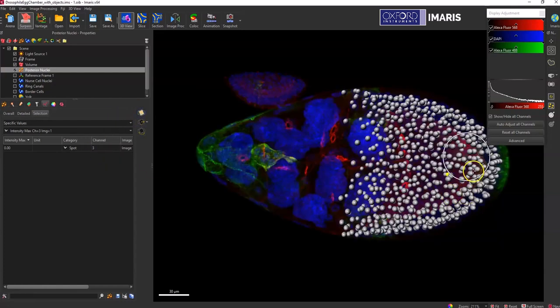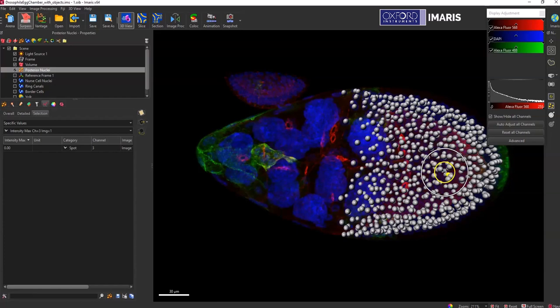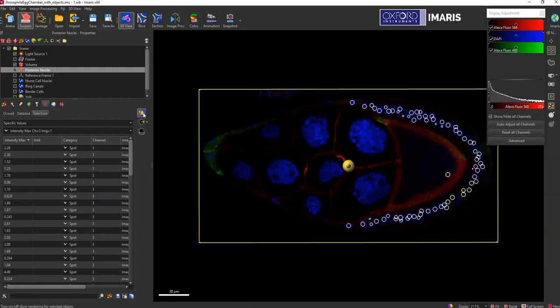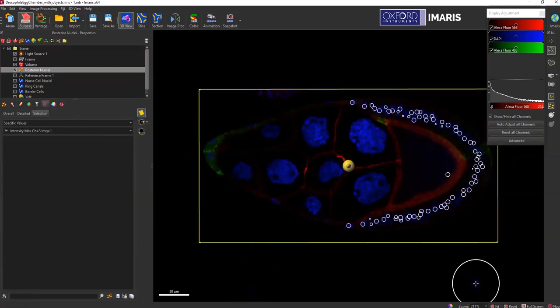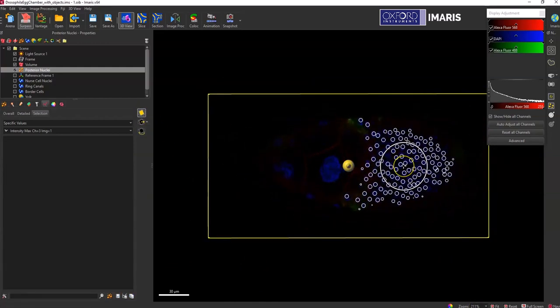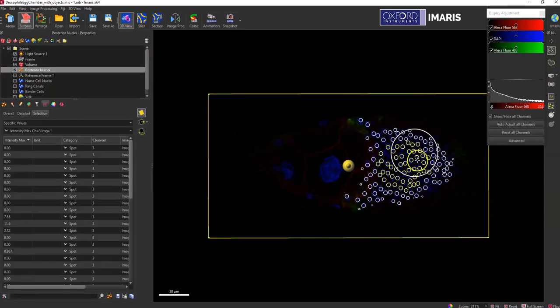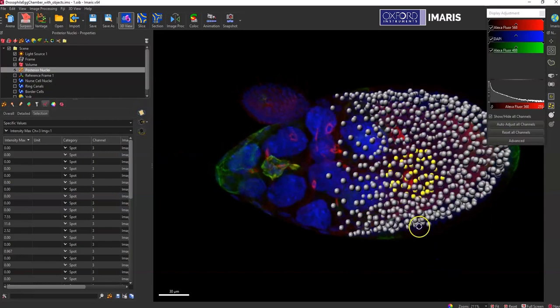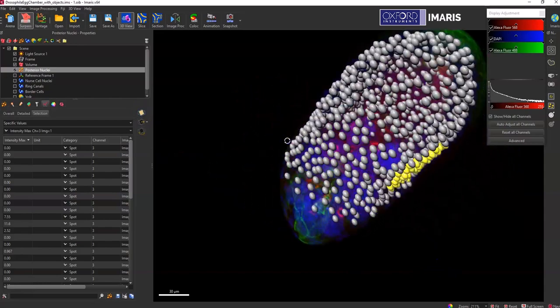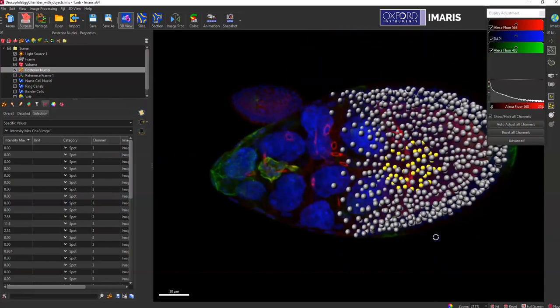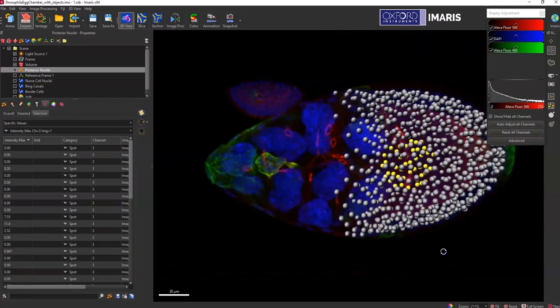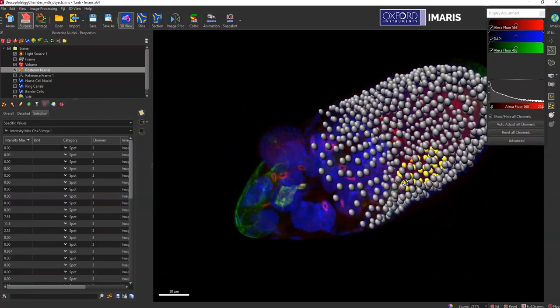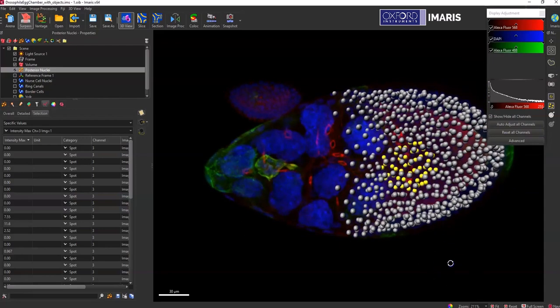But if I switch back to volume rendering, you can see there were a whole bunch more objects that would have been selected if I was in volume rendering. But because I was just in that slice rendering mode, I can have a little bit finer control of what's being selected. And so if we switch back to volume, you'll see that only that plane that was actually displayed in the slicer rendering was what was selected, not the entire volume.